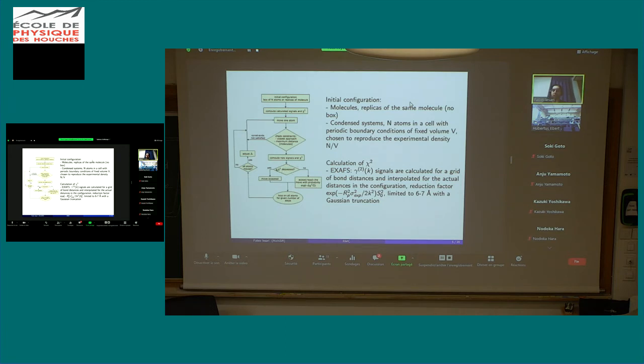And if the residual is decreased, the new configuration is accepted. If instead it's not decreased, we can still accept it with an accept or reject probability, which is the same as the Metropolis algorithm. So the probability is given by the difference in the residual. And we repeat this process many times, basically for all atoms and for many steps. After we do this a number of times, in the end, we will have a configuration that fits our experimental data, basically.